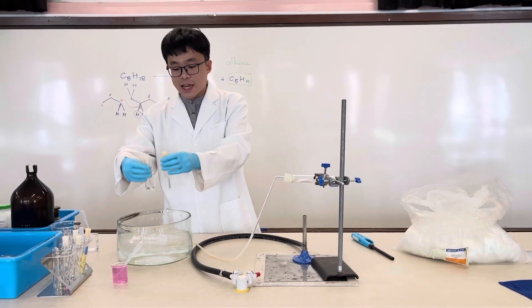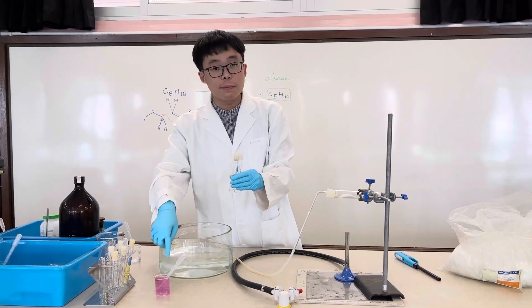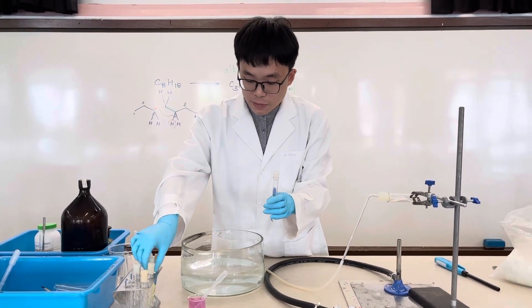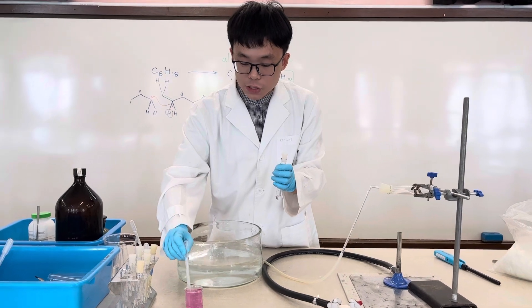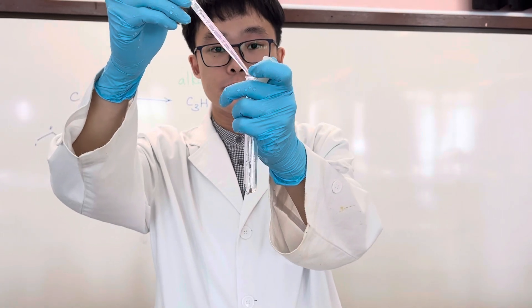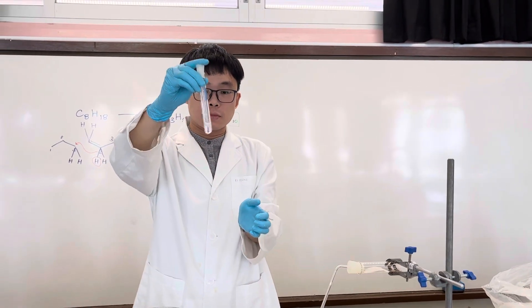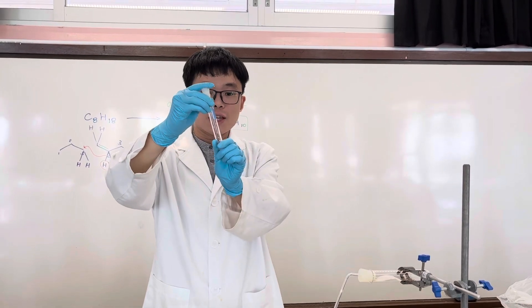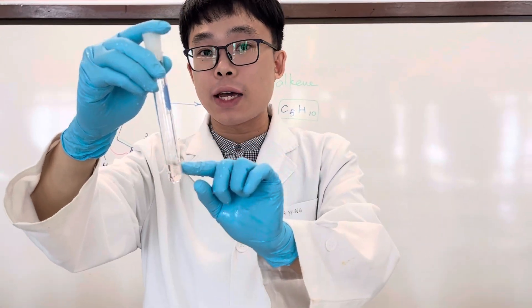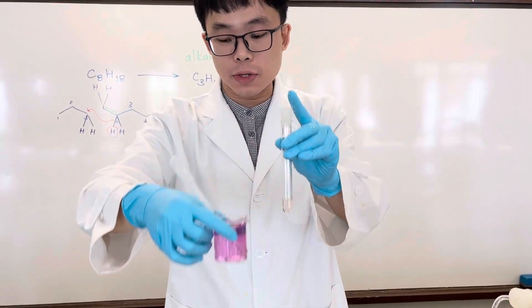We are going to test the gaseous product with two solutions: acidified potassium permanganate solution and bromine solution. The potassium permanganate solution was purple in colour. When I add it into the test tube and stopper it back, you can see it has been decolorized already. Why does it turn from purple to colourless?